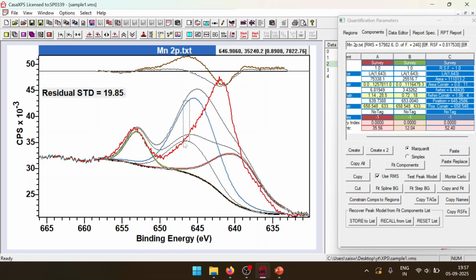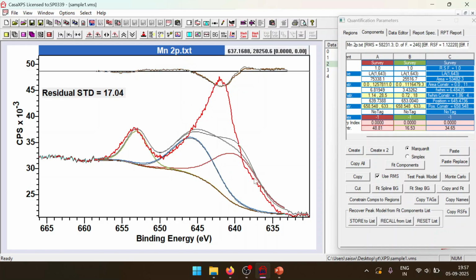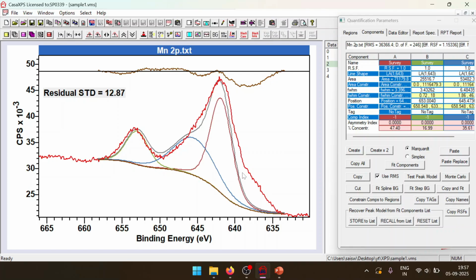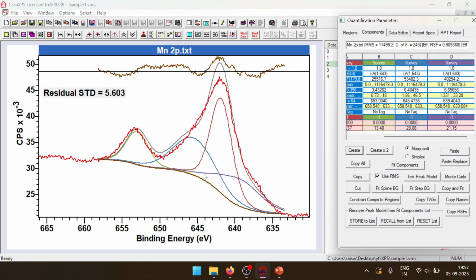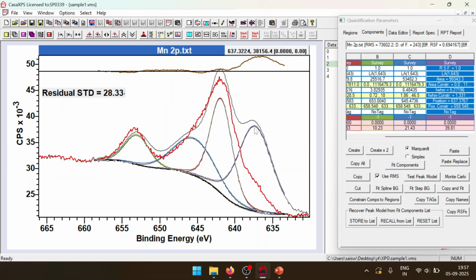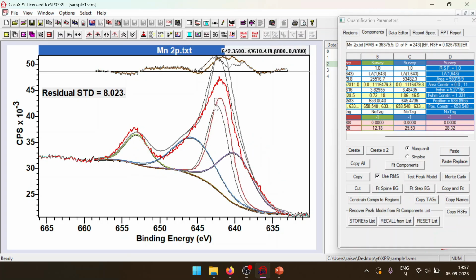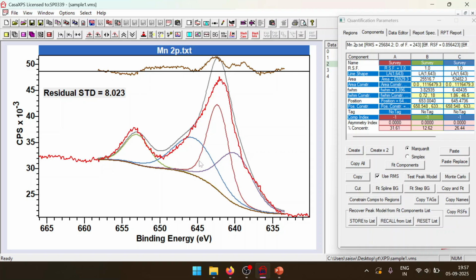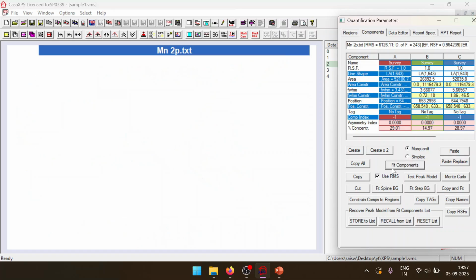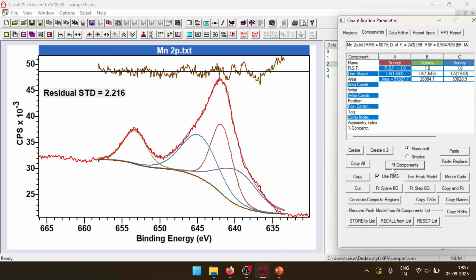When doing it, always first consult your literature, then make a rough estimate. Let's say I saw some paper that says it has four peaks. So first roughly put all the peaks in their intended positions and shapes. Then do the fitting. Don't put four peaks continuously in a row and do the fitting, because it will take longer and won't converge correctly. Better to put them in a good shape however you like, then start fitting. It makes it easier for fitting. So keep on doing that, fit components, and it happens.